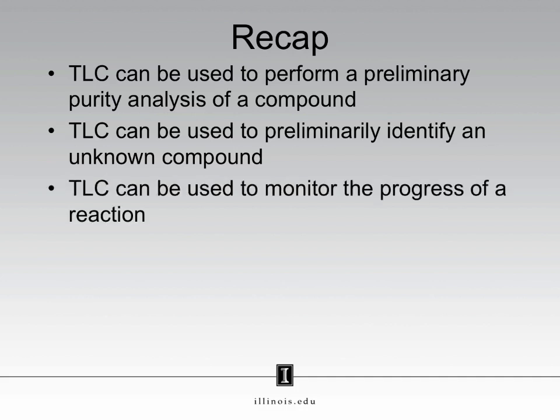Finally, TLC can be used to monitor the progress of a reaction. If TLC analyses are performed over the course of a reaction, you may be able to see starting materials disappear and products appear on a TLC plate. When all starting material is gone, you know that all of your starting material has been consumed and the reaction is complete.